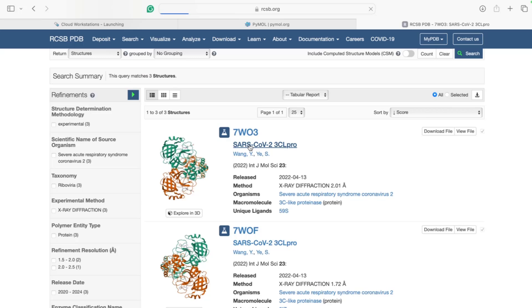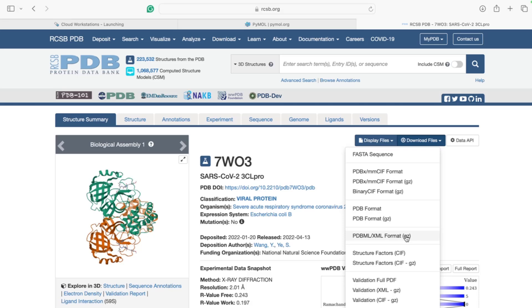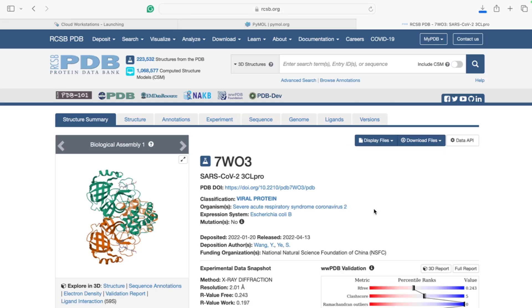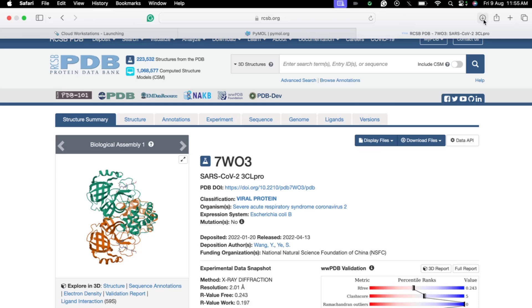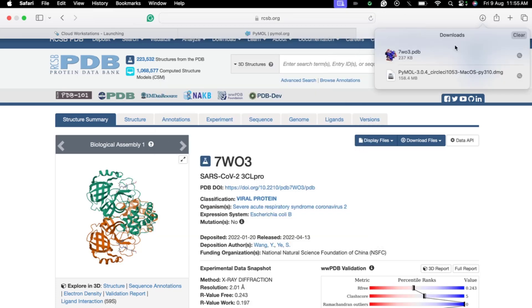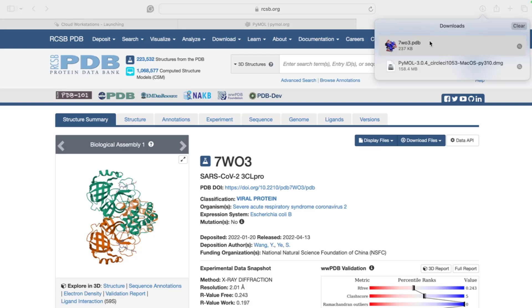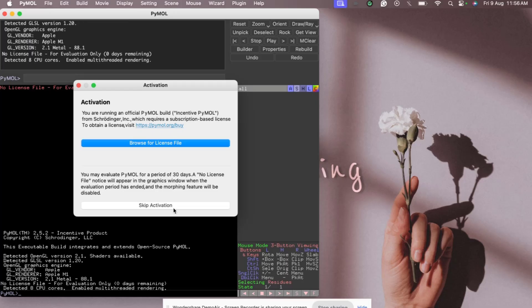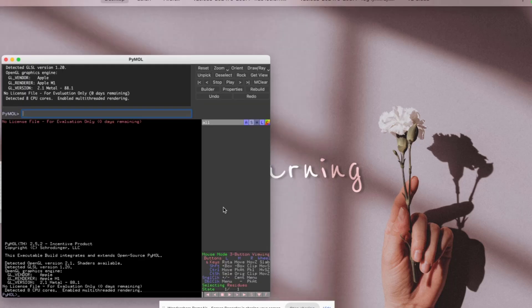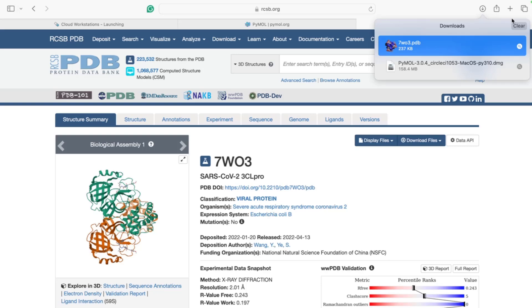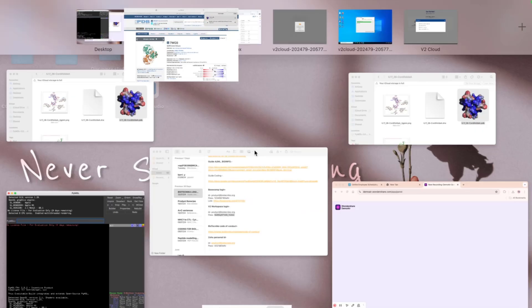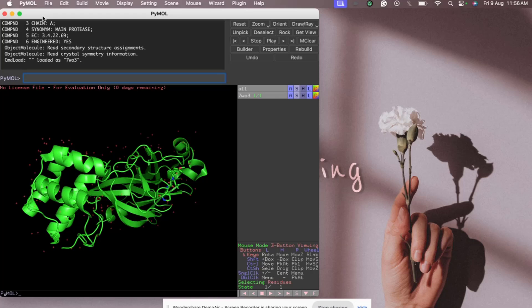Once we're on the PDB page, we can download the protein in PDB format. After clicking download, the file is saved. Double-clicking on it opens PyMOL, and the structure is loaded. You can see the protein loaded in the PyMOL viewer.